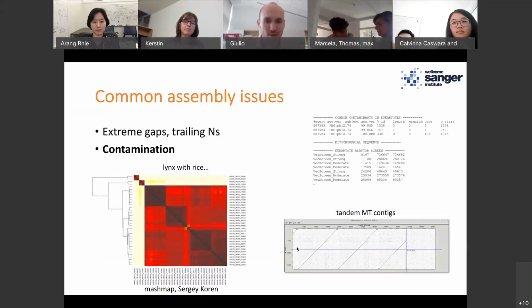I already told you a bit about contamination. So we look for phage contamination, vector, adapter, everything that can come out of the usual lab procedures. We look for contamination with other species. We set aside, for instance, organelle genomes and inform Julio about them.